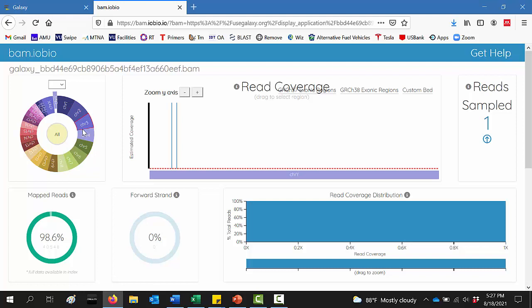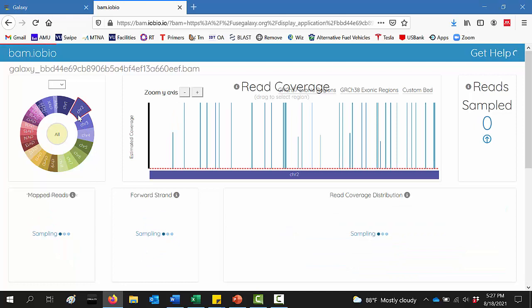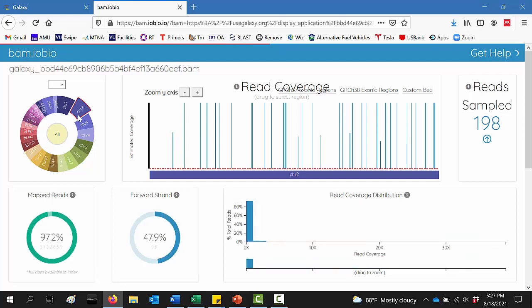And I'm just showing you the 10,000 foot view here. You can zoom in a lot more than this if you want to, and you can actually see how many reads were mapped to each gene on these chromosomes and where they mapped. So there you go. I show you this because it really does a good job of illustrating what we just did. HiSat2 took all those random sequence reads and mapped them, showing you where they align to in the human genome.